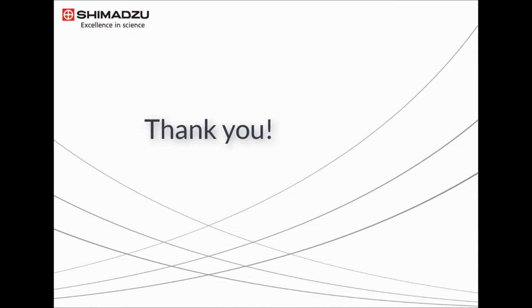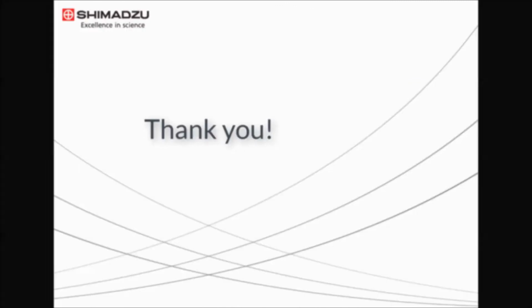This concludes our brief demonstration of the i-Peakfinder feature in LabSolutions software.